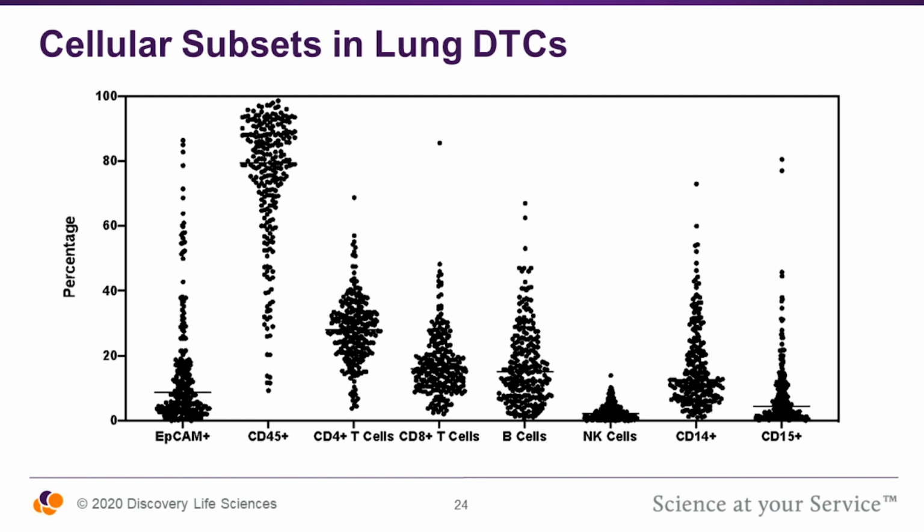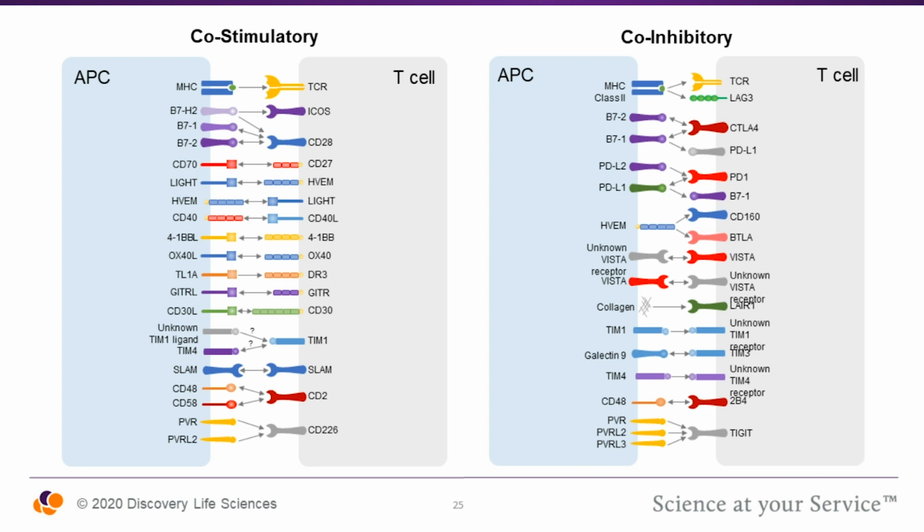And then as far as each of the immune percentages are concerned, there are some that are high for T-cell infiltration or myeloid infiltration. And so it really is heterogeneous among the population. So we use this data mostly to help with sample selection for studies that are focused more on T cells or B cells or monocytes. But within an indication, you will have a high degree of variability.